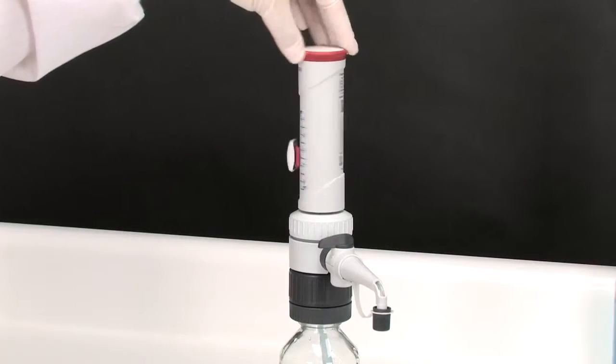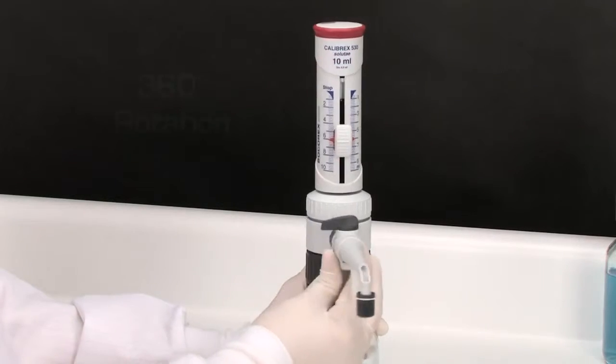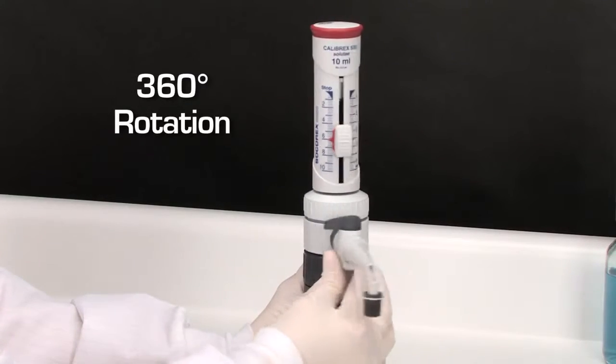The dispenser rotation provides maximum working flexibility. And the delivery jet can be positioned as needed over 360 degrees.